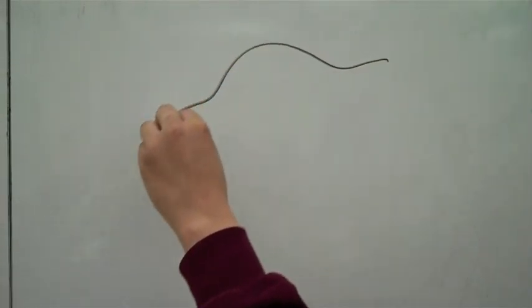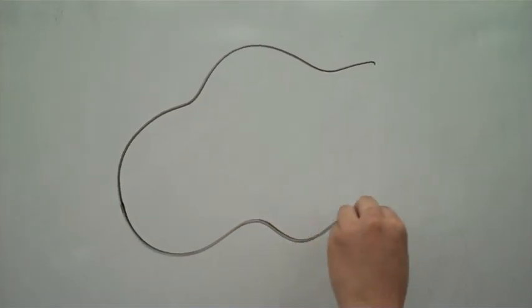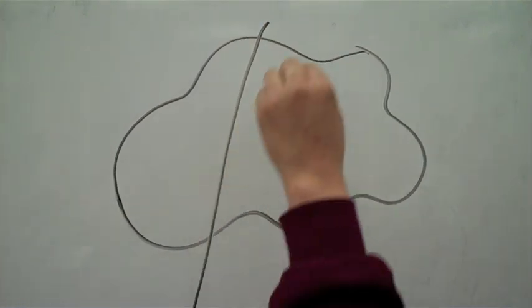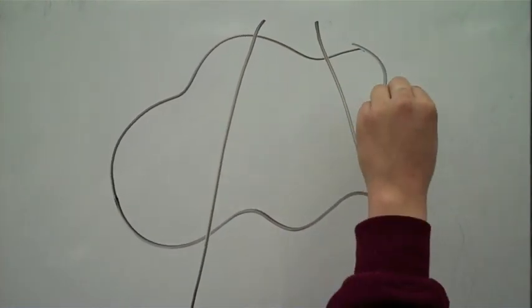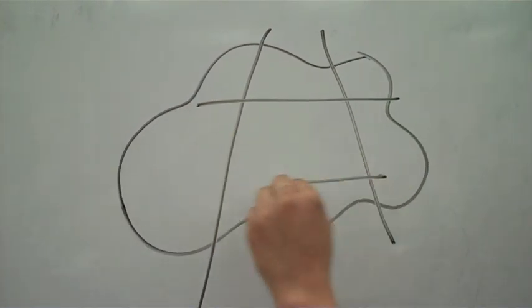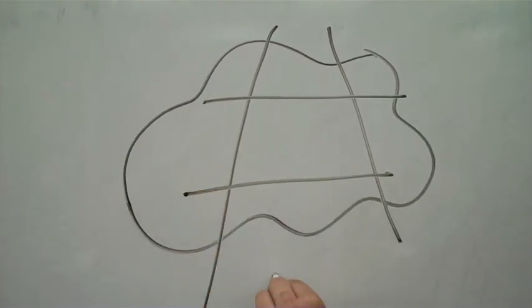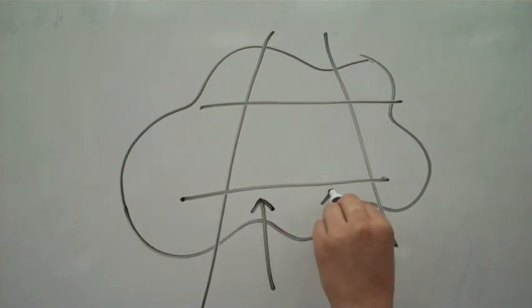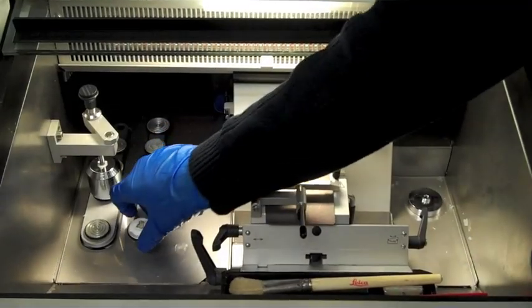You should cut your specimen into the shape of a trapezoid with a razor after it is frozen. This makes creating a smooth section easier. When sectioning, the blade should cut into the base of the trapezoid.